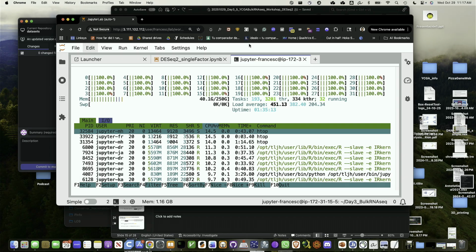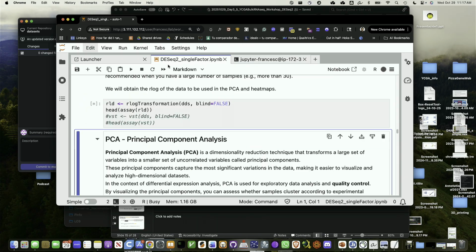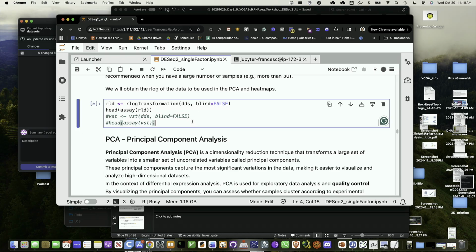So actually what happens in most of the data sets is that when you have gene expression levels, lowly expressed genes have higher dispersion. So what happens really is you want to control the dispersion in your data. By transforming, you are pushing those lowly expressed genes further toward the line. And this is log for that.